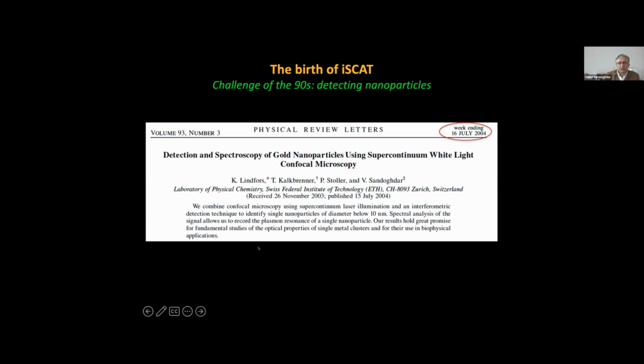So it's really in the context of trying to push the sensitivity limit without using fluorescence, but still using light. And gold nanoparticles have been used for a number of applications, especially in electron microscopy as label. So it was exciting to see how far you could go down to see gold nanoparticles using light.